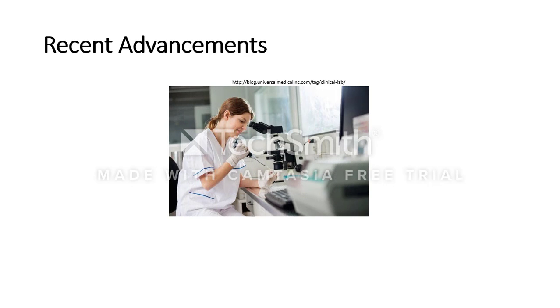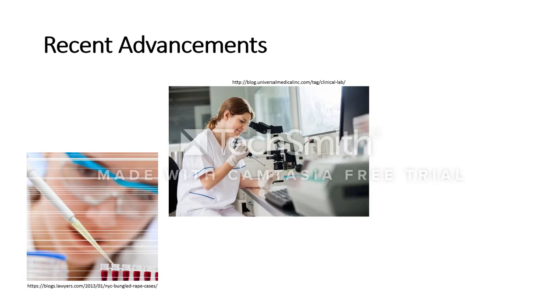Now let's talk about some recent advancements that they've been doing for this technique. Better pre-amplification methods are being utilized in order to standardize the samples. This allows for the profiling of large numbers of markers, starting with minute sample amounts such as single cells, and determining the quantity of cDNA in the sample. An approach known as selfie qPCR was recently created in which no reference gene or housekeeping gene is required. Instead, a comparable absolute digital expression level will be generated to share between all of the labs, thus eliminating the need for multiple reference genes.